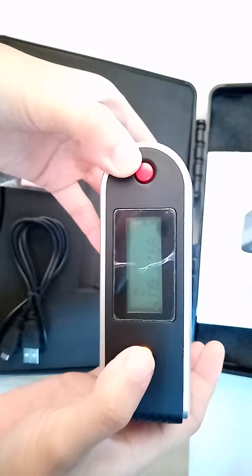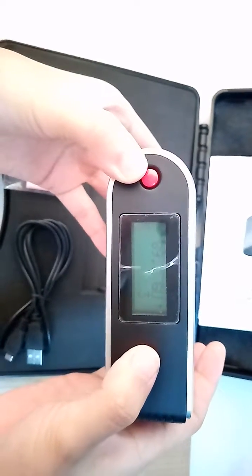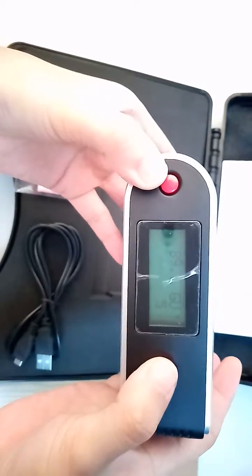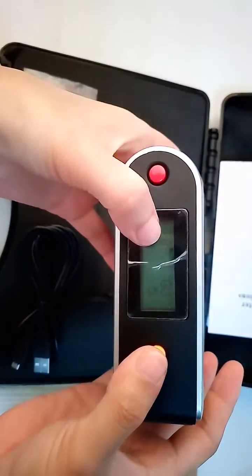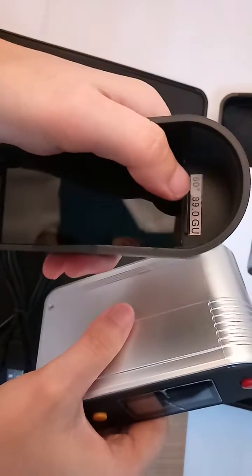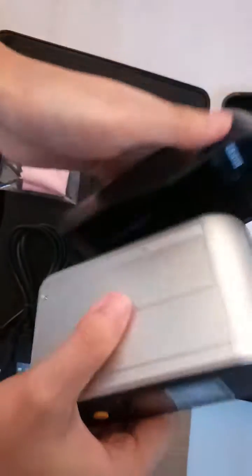You can test now, four to five times. The value is 89, because the standard calibration tile is 89. Same, same.